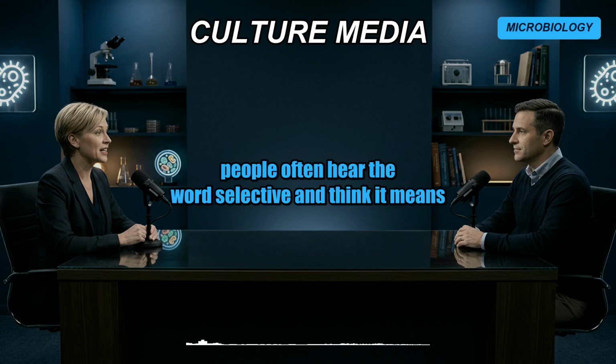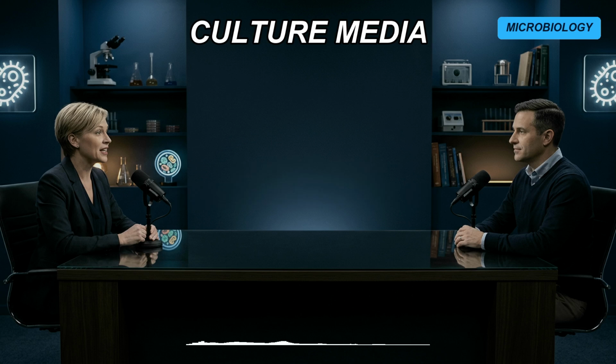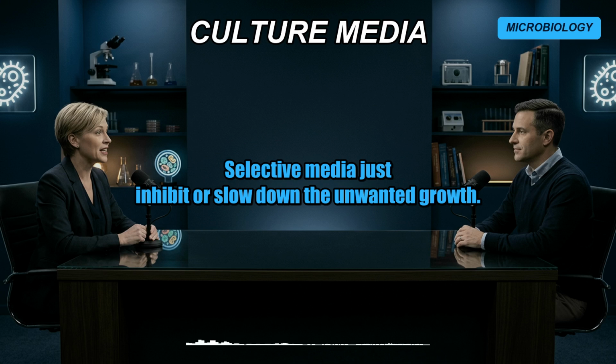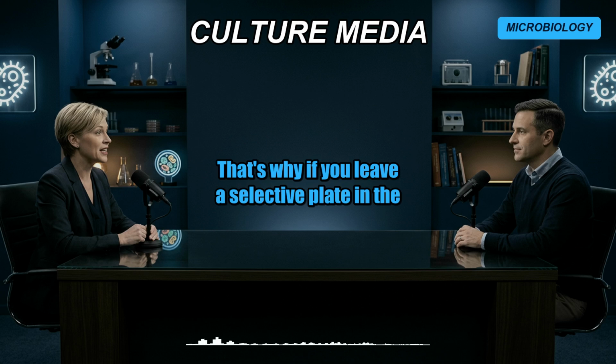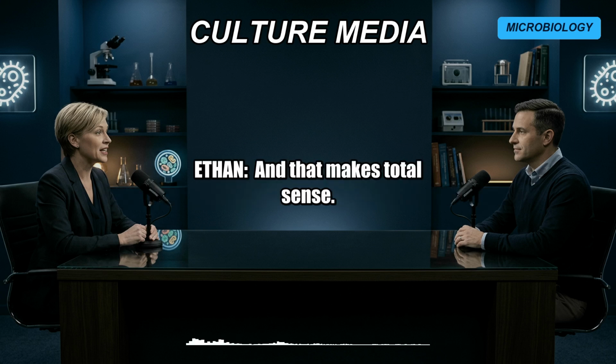And you know, people often hear the word selective and think it means the plate instantly kills everything else on contact. Oh, right, like a sterilizer. Yeah, but it doesn't sterilize the sample. Selective media just inhibit or slow down the unwanted growth. That's why if you leave a selective plate in the incubator for way too long, those suppressed organisms can eventually fight through and start to overgrow. And that makes total sense.